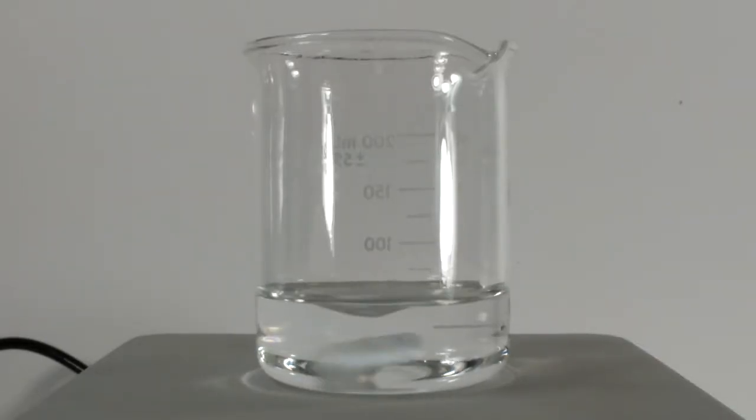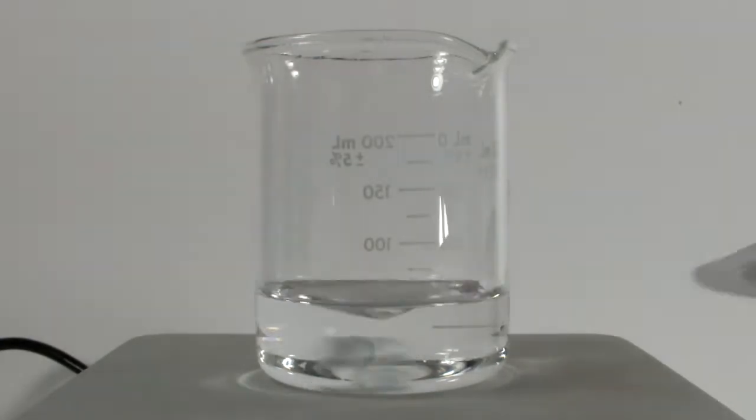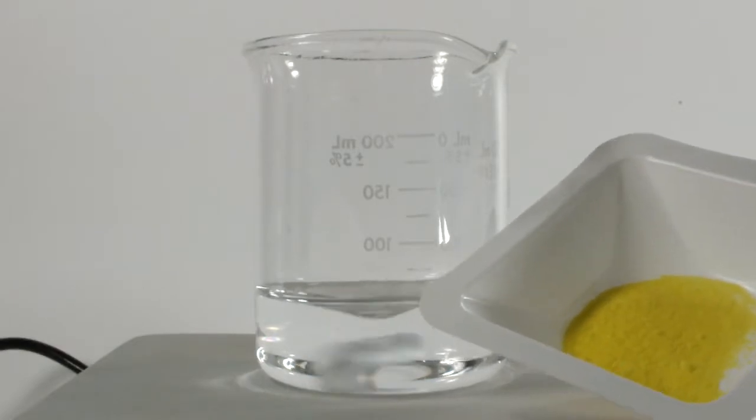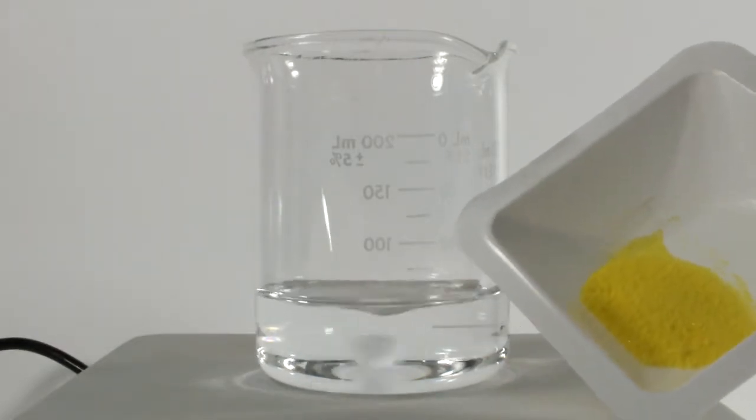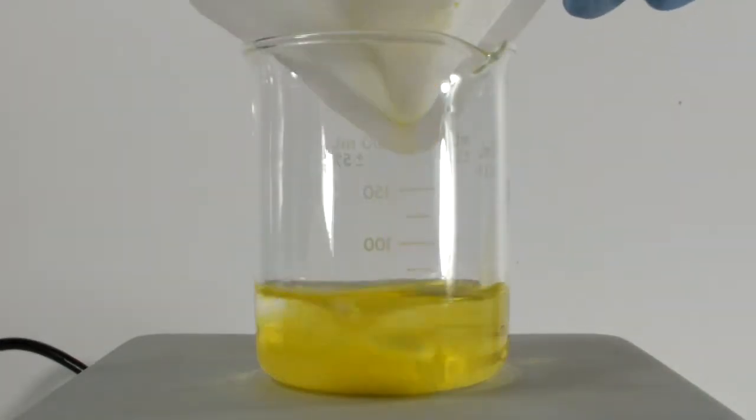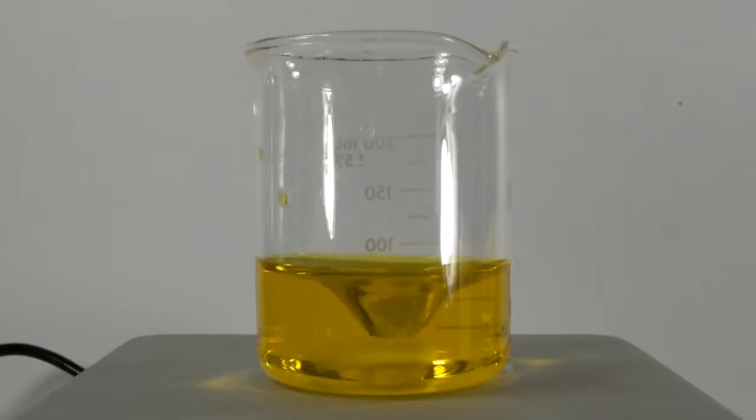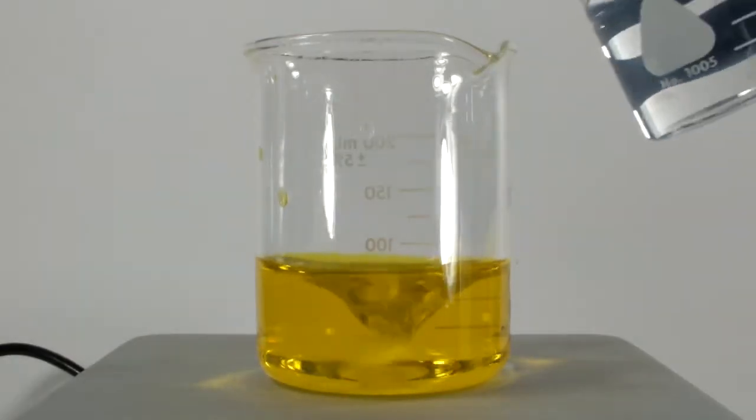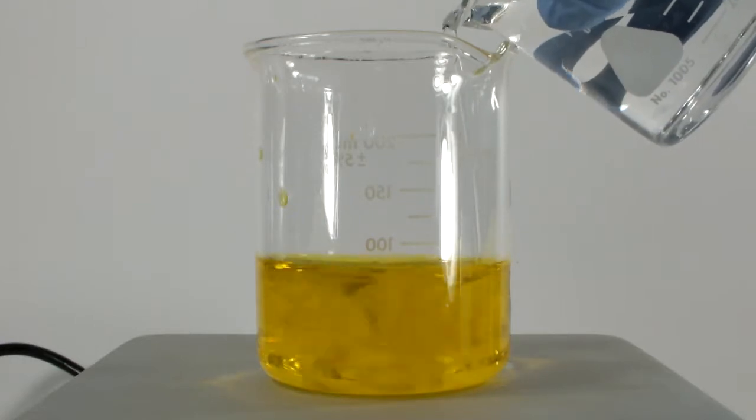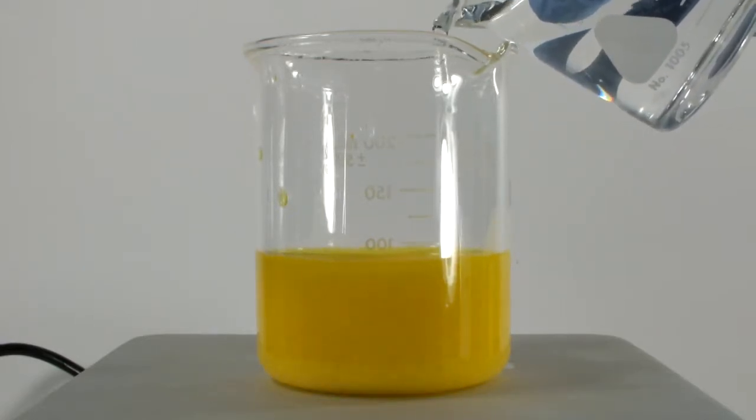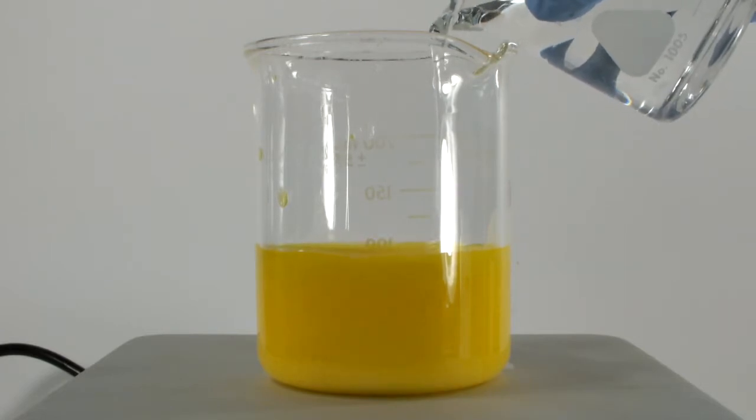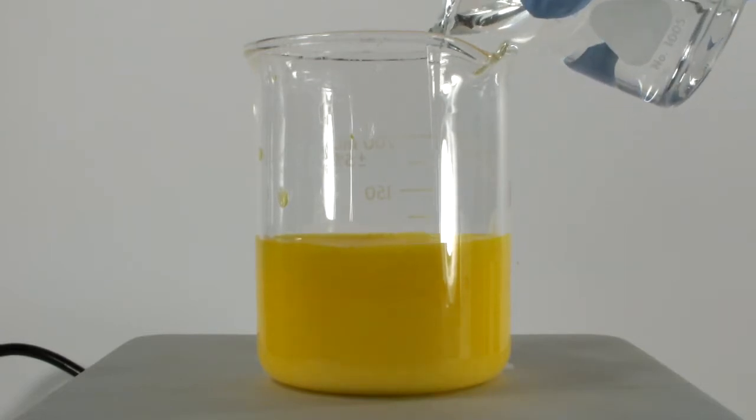As common as the lead iodide reaction is, it's certainly not the only reaction. I have here about 50 milliliters of water, and I'm going to add these 4.86 grams of potassium chromate and stir it until it all dissolves. I'm going to add 50 milliliters of a 0.5 molar solution of lead nitrate, slowly so as not to overwhelm the stirrer. I have a little excess of the lead nitrate, so all the chromium is reacted.